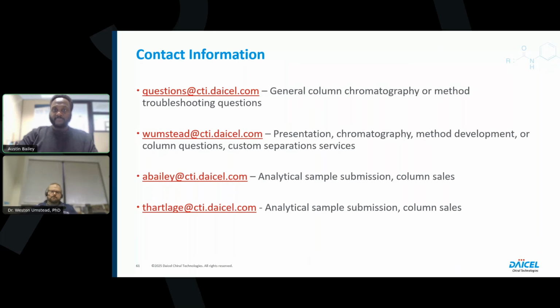Thank you, Wes. So next we have a question from Francis, asking, how do you resolve peaks of enantiomers when one is in the positive mode and the other is in negative mode on ChiralPak ODH?